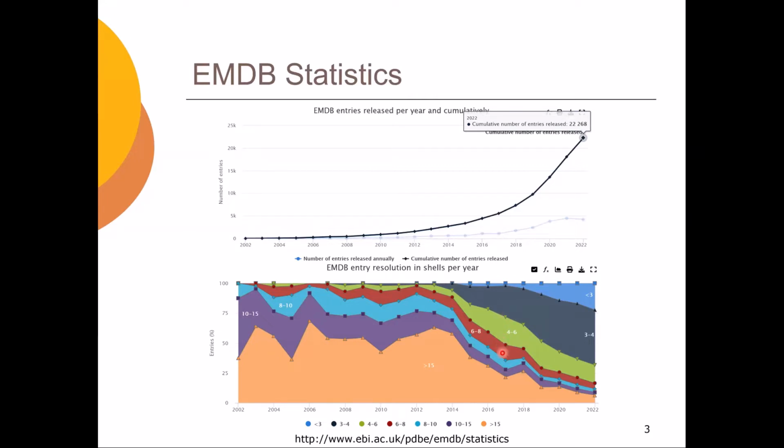the resolution at that time is around here. So about 1/3, this is 8 to 10, and this is 4 to 6. So a little over 1/3 of the maps are between 4 to 10 angstrom. First we started to work in this range, and then recently more and more higher resolution maps are determined. So recently we work more closely on better than 4 angstrom.